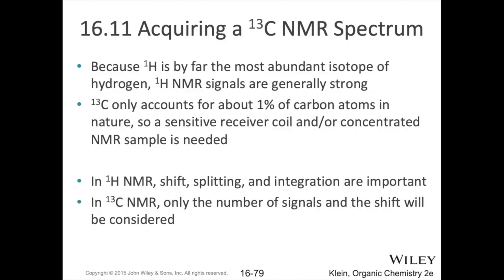Carbon-13, on the other hand, involves a little bit more work. It takes a little bit longer to gather enough data to get a decent spectrum. Instead of just running one in 15 minutes like proton NMR, you'd actually try and run those overnight, or at least have a large enough block of time, a few hours, to collect enough data to get a good high resolution spectrum.